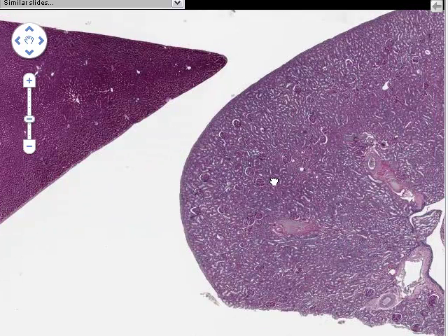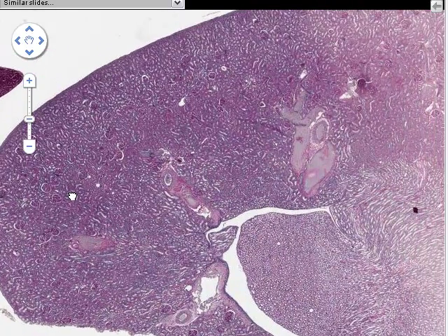The reason that the kidney is such a good slide to see epithelium lining tubes on is that the kidney is actually made up essentially of millions of tubes, highly coiled and closely aligned with one another. And indeed, understanding the arrangement of the tubes in the kidney can be quite difficult until you have a little bit of experience with histology. Fortunately, we don't have to look at the whole kidney, just at one particular part of it.